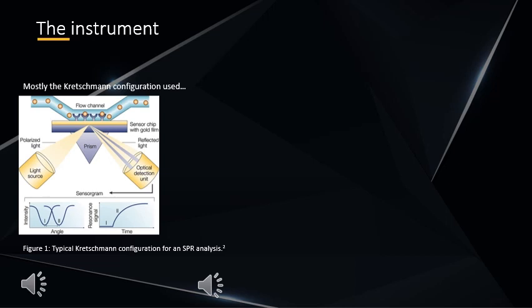This is important as upon total internal reflection, an evanescent wave is created in the dielectric, which in turn excites the electrons on the metal film and causes them to oscillate. So the lack of a magnetic field causes it not to interfere with the evanescent wave, and instead helps it excite the free electrons on its surface due to its conductivity.